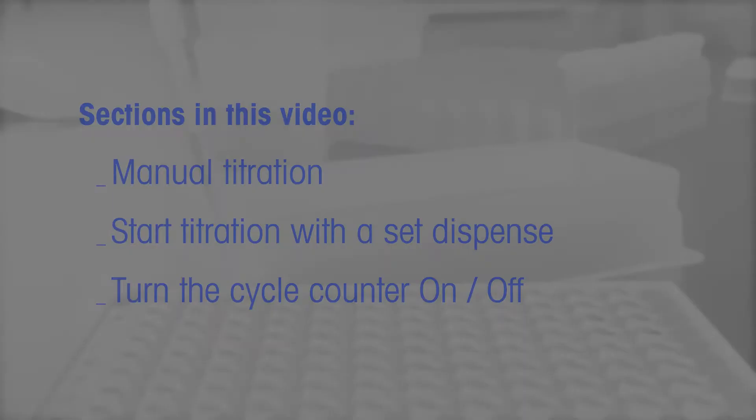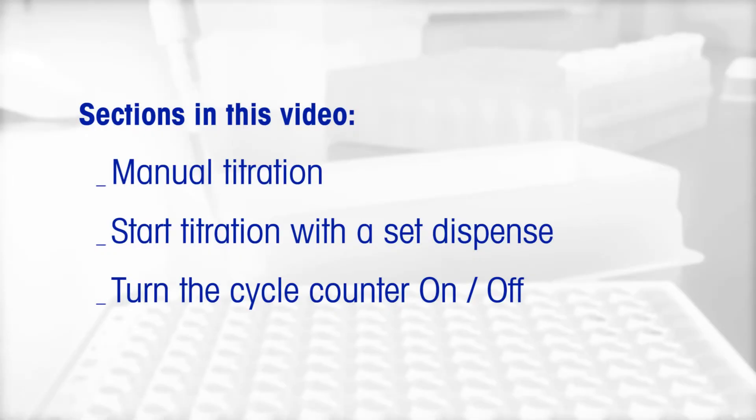Sections in this video: manual titration, start titration with a set dispense, and turn the cycle counter on or off.